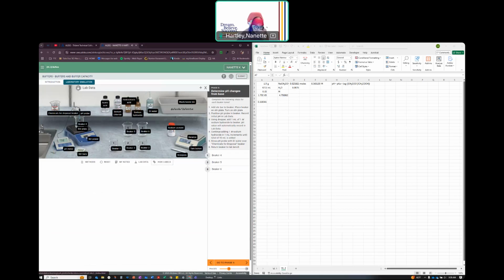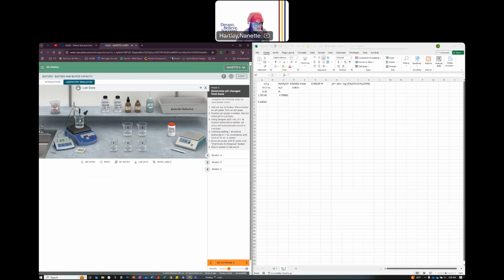So we're going to show our labels again. 2, 5, 6, 7, 8, and 10. Put this back. Take this out.